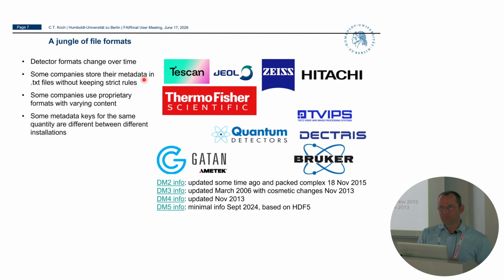So, companies, I think companies don't want to basically harm you with changing their format. It's just because, of course, they develop their instrumentation. It has new needs and new data needs to be stored. And so they find, okay, the old format doesn't deal with it. And so we have to somehow expand on it.